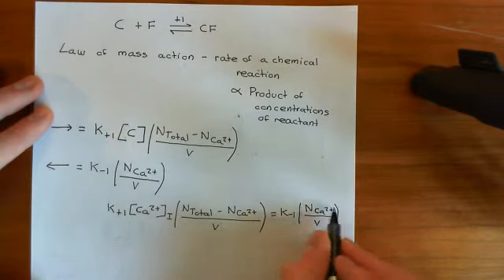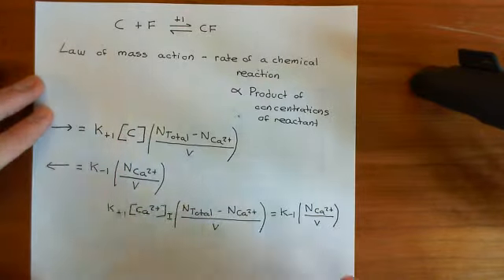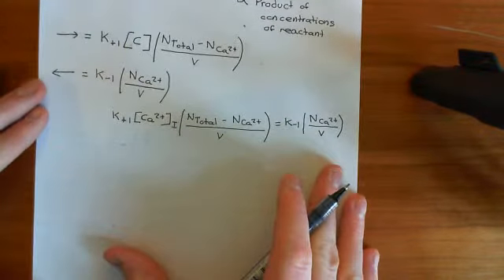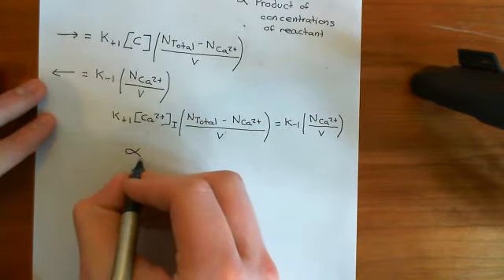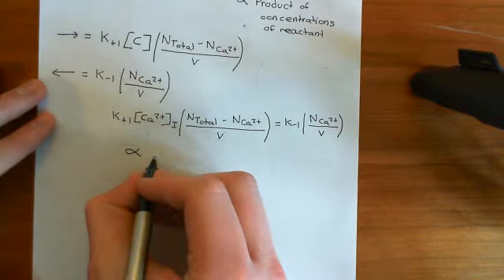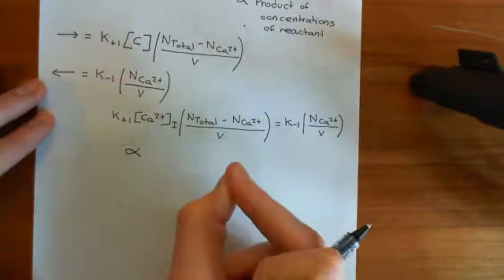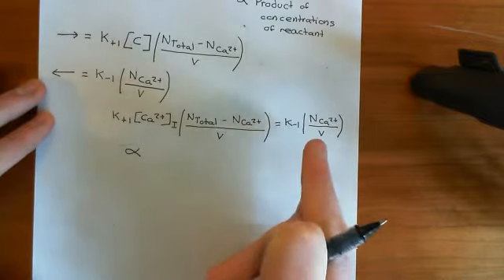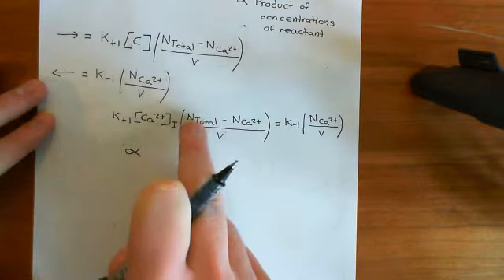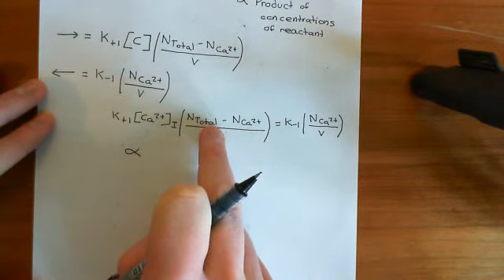Now, if we wanted, we could work out from this the concentration of calcium Fluo-4 complexes here. We could isolate this on its own, and we get it in terms of the total concentration of Fluo-4 molecules within the cell, which is something that we don't know. Instead, what we're going to work out is the occupancy, because remember, that's what we were trying to derive.